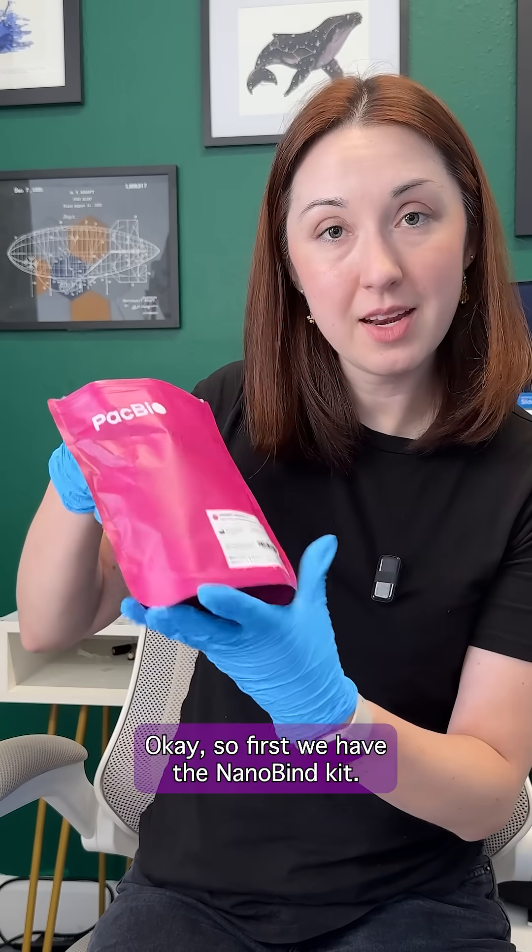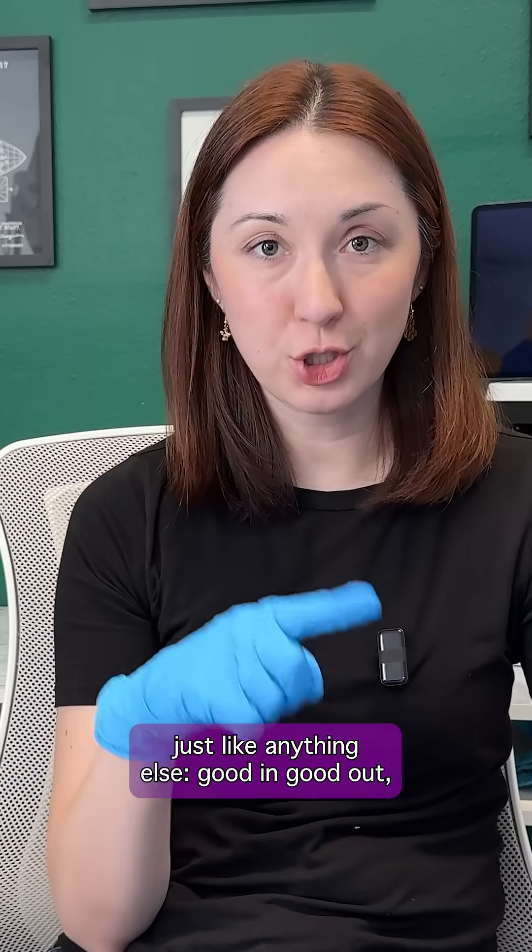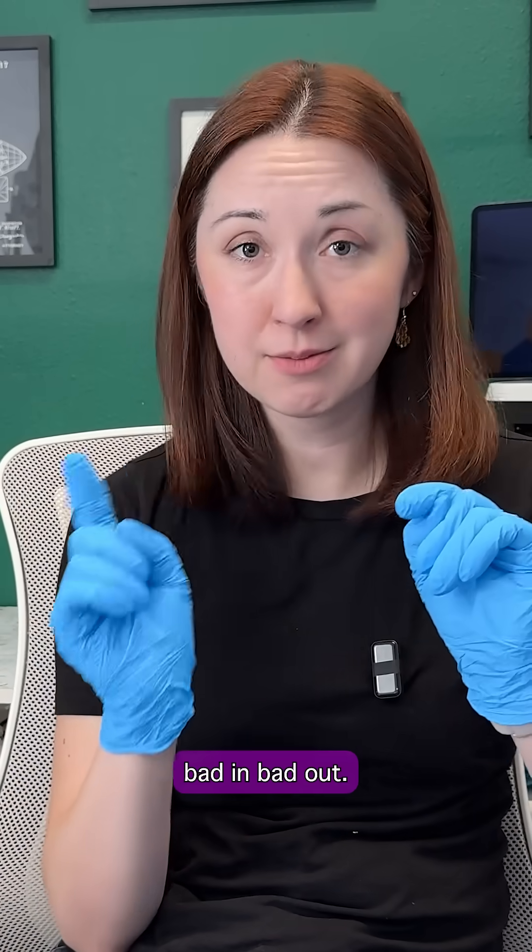First, we have the nanobind kit. Let's get this right in the fridge. Just like anything else — good in, good out; bad in, bad out.